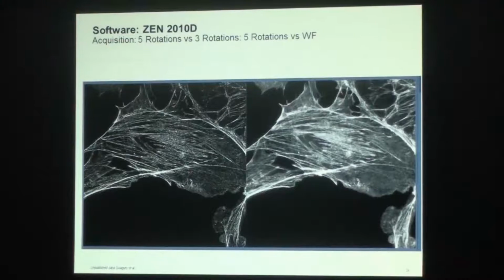Can I ask a question? Yes? Have you tried stereoscopic images? What do you mean with that? Slightly offset so that you can get a stereo view, a 3D effect? Oh, from the obtained images, you wanted to make a stereoscopic 3D view. You move the objective a little teeny bit, make another image, and you get a 3D view. Yes, I haven't done that yet.